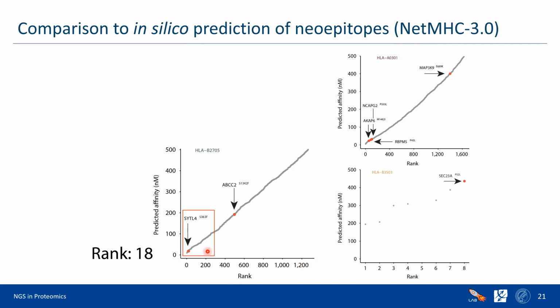So you see, there are not just a few mutations, a few peptides which you can find using genomic data. You see these gray dots, it's all mutations which pass the limit of 500 nanomolar, which have somatic nature, which we find in these patients. So there's really a lot. And if you want to check each of them one by one, you probably start from the strongest binders and go to the weak binders. But this is a really laborious process. It requires a lot of work, etc.